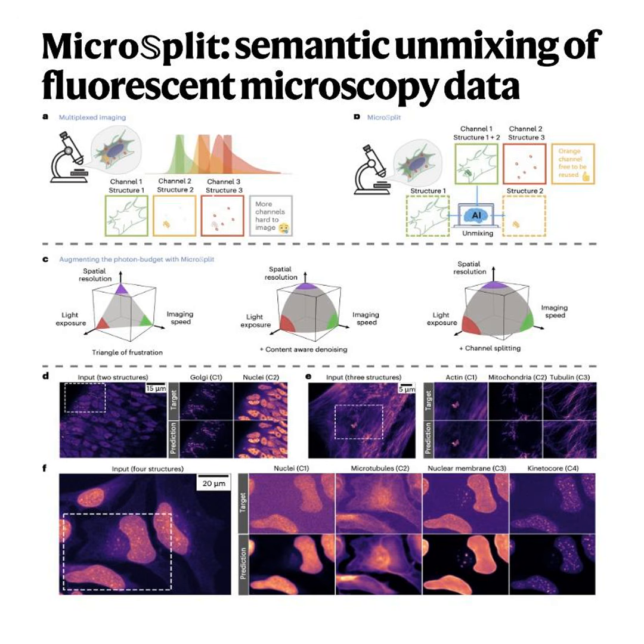And that physical limitation is exactly what makes this paper so fascinating. Because they didn't try to invent a better lens, right? Or a less toxic fluorescent tag. They just bypassed the hardware limit completely with software. That is the paradigm shift here. They approached a physical optical bottleneck purely as a computational problem.